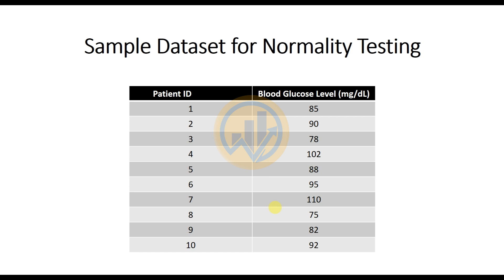This is a sample data set for the normality test in OriginPro software. We take the same age group for 10 persons. This is a person ID and we take blood glucose level in milligrams per deciliter for each patient. Person 1 has the lowest and person 7 has the highest blood glucose level. We will use this data to calculate the normality test.